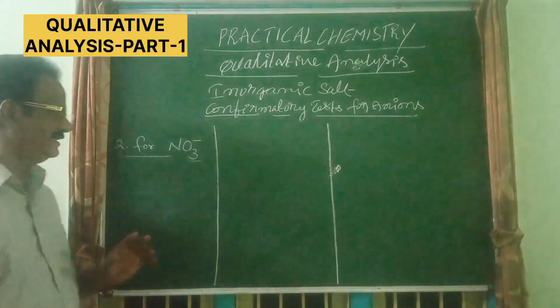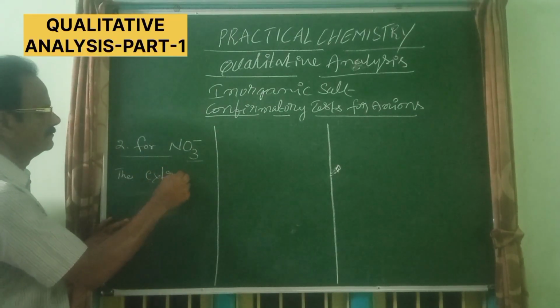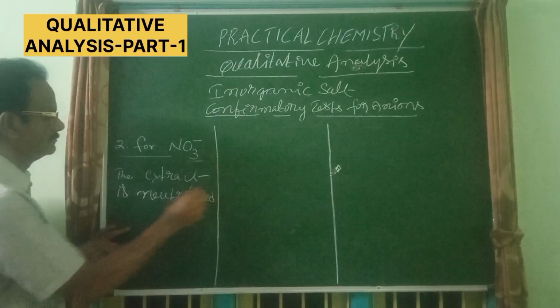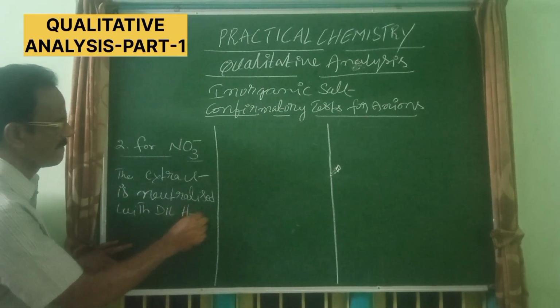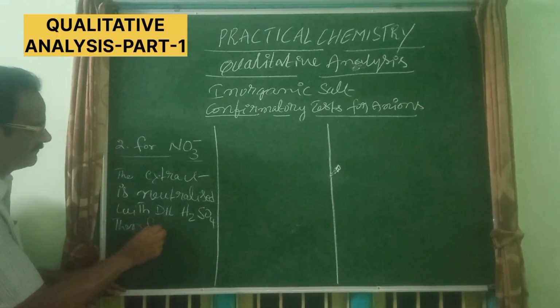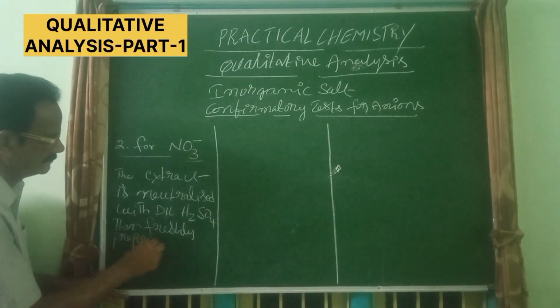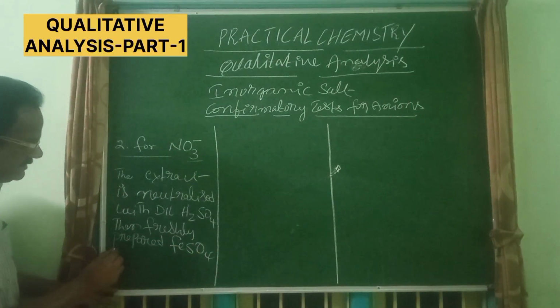The extract is neutralized with dilute H2SO4, then freshly prepared, keep in mind, freshly prepared FeSO4, means ferrous sulfate, is added.